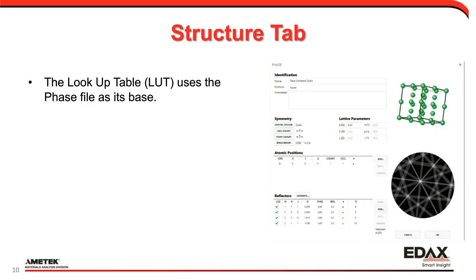You can go ahead and search them inside of our little search engine, and I'll pop them up. Now, I will tell you that this is one of those dangerous things. Not a flaw of EBSD, but a downside of EBSD, is that you're looking at these structure files. So if the structure file is the same between two phases, it can be a problem. And again, we'll talk about that in a little bit more depth later on. So how do I actually build that lookup table?